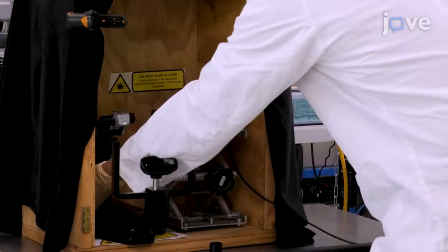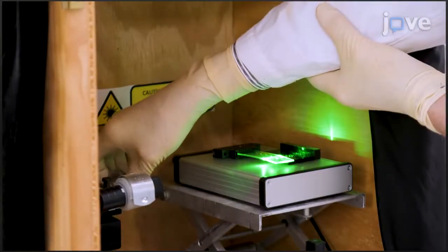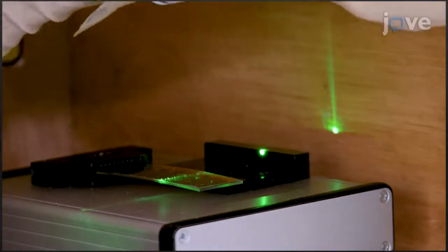This platform provides valuable data to design strategies for thermal therapies that permit optimization of the laser parameters, particle size, particle coatings, and composition. Demonstrating the procedure will be UTS researchers Professor Stella Valenzuela and Dr. Amani Alghalayini, along with Professor Bruce Cornell from Surgical Diagnostics.